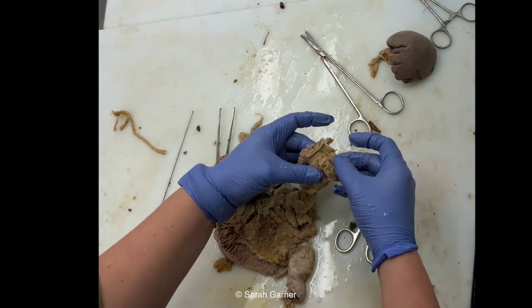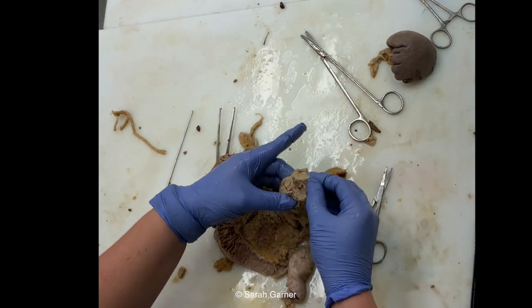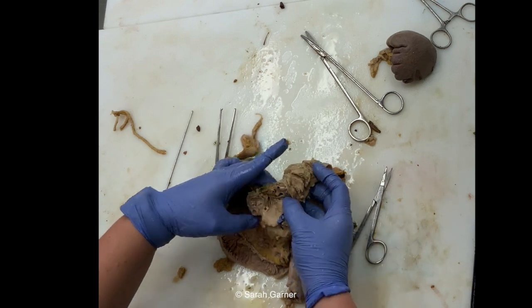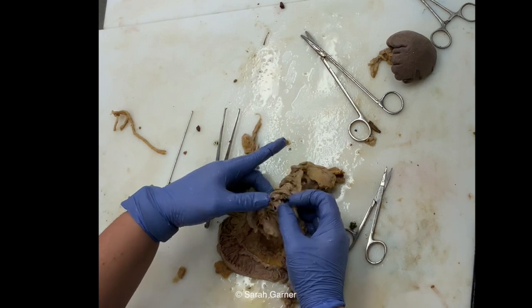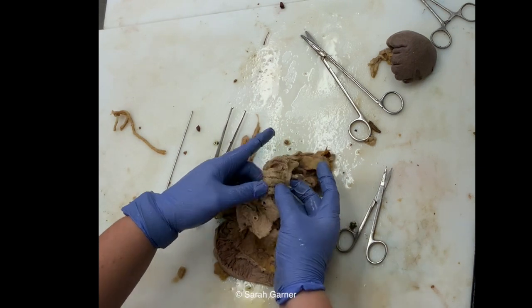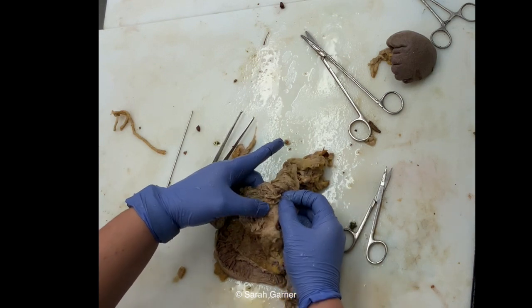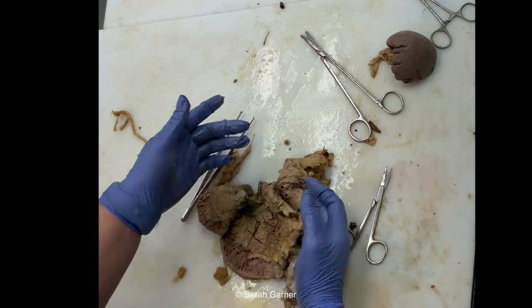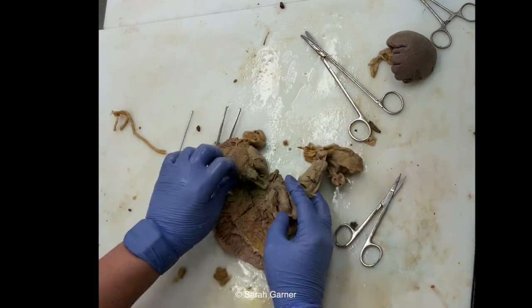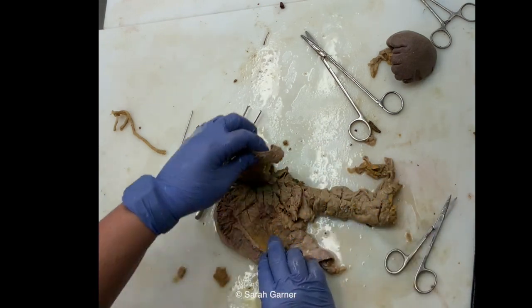So here again, we have cut into our pancreas, and you just want to thoroughly examine the cut surface just like we did with all the other organs. Note anything abnormal, and submit sections of anything abnormal. Here you can see your splenic artery, your splenic vein, and there's your duct right there. This is probably really hard to see on the video since everything is so tan. In a fresh specimen, it'd be a little more yellow, which makes it easier. But that's essentially opening that up.